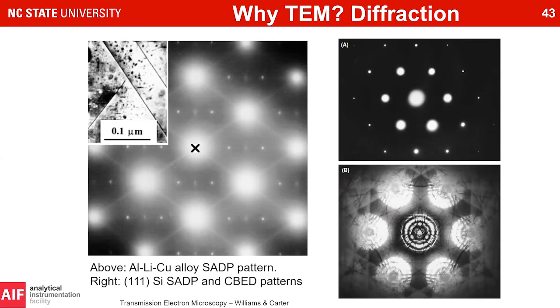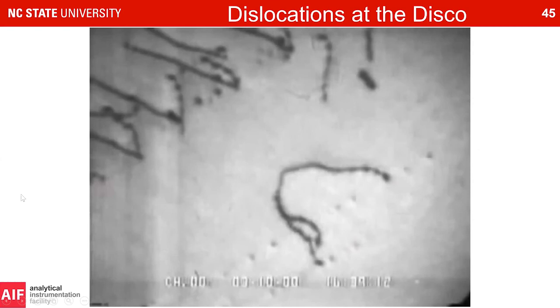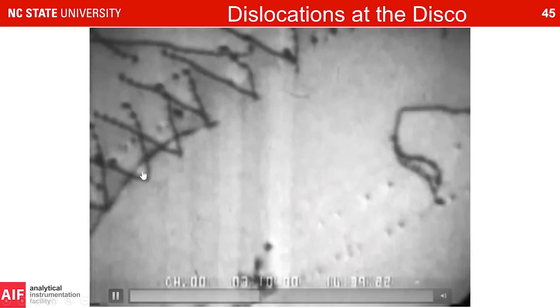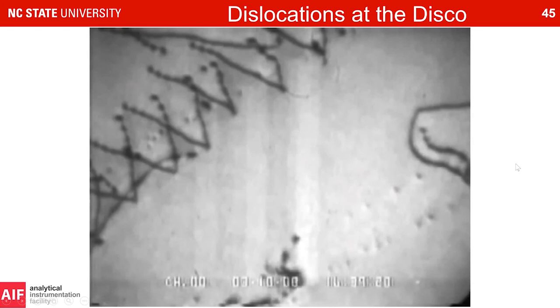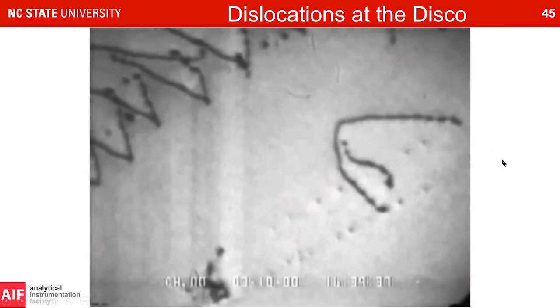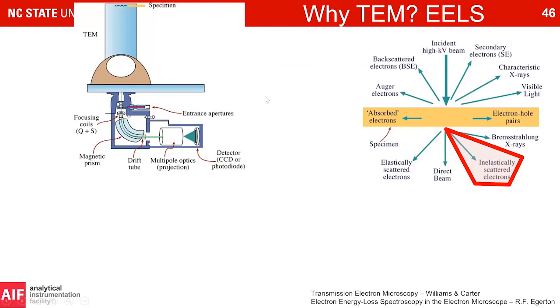We can also look at defects. Here's a dislocation source emitting dislocations — you can see them wiggling around and getting tangled up, imaged in the TEM. If you're working on imaging defects, whether dislocations or planar defects, TEM is incredibly powerful. We can adjust the microscope to get incredible contrast from those defects.